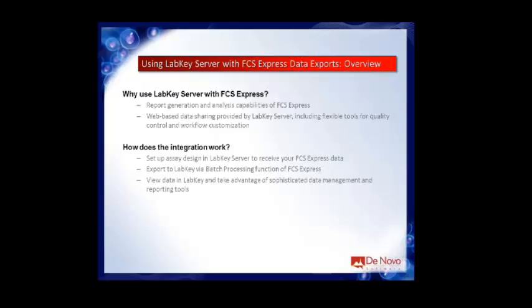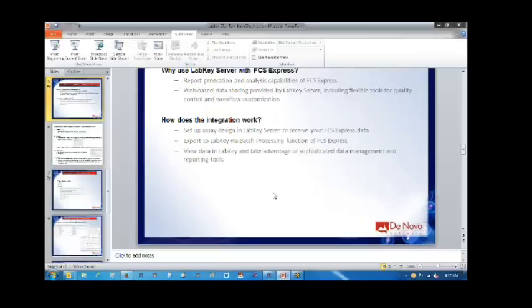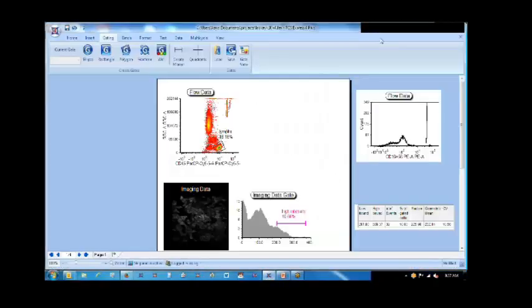So let's just change gears for a minute, and I'm going to go to FCS Express. So this is a very, very simple layout. There's really nothing special about it.